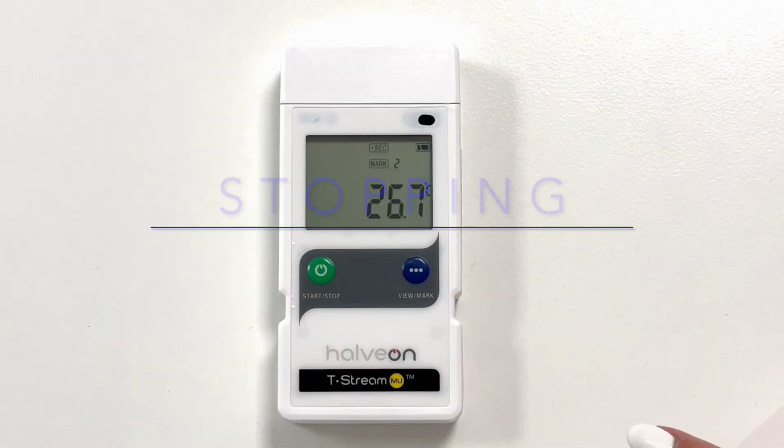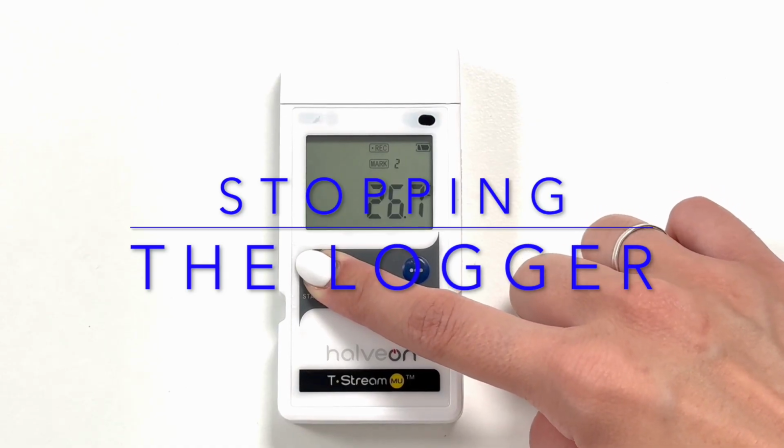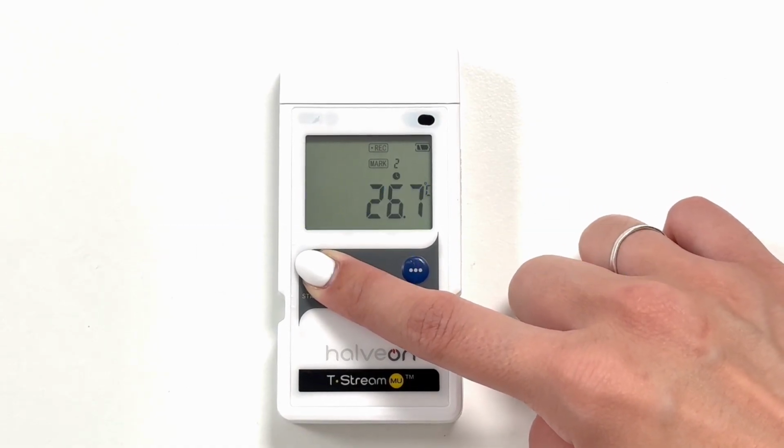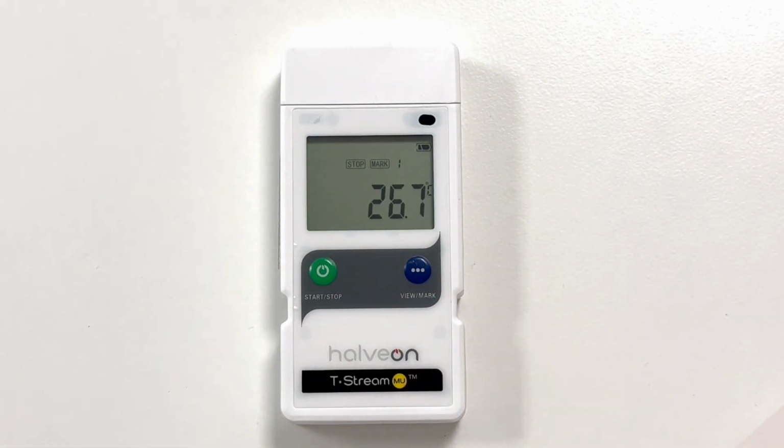Part 6. Stopping the logger. In order to stop the logger, the user has to press and hold the Start/Stop button for more than 4 seconds until the clock icon appears. Then release the button within 2 seconds to stop. The LCD will display Stop, indicating it has stopped recording successfully.